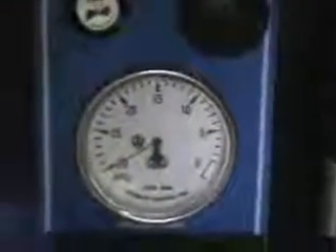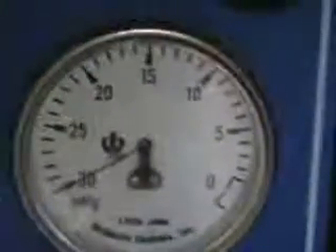From Hitech Trader. This is the VWR 1450 D vacuum oven. Right now it has been holding vacuum for about a day and has not moved. Set point is at 45 degrees.